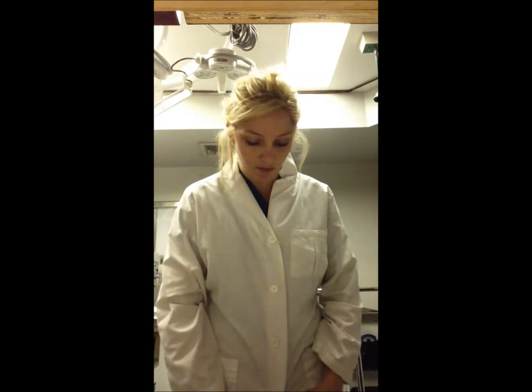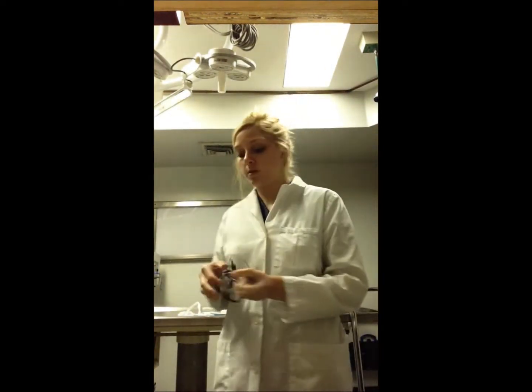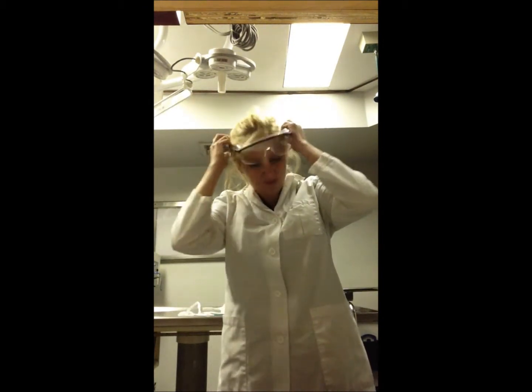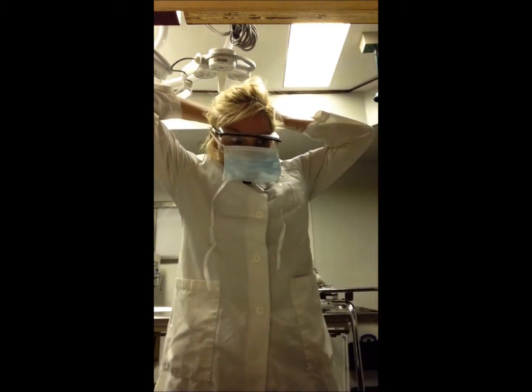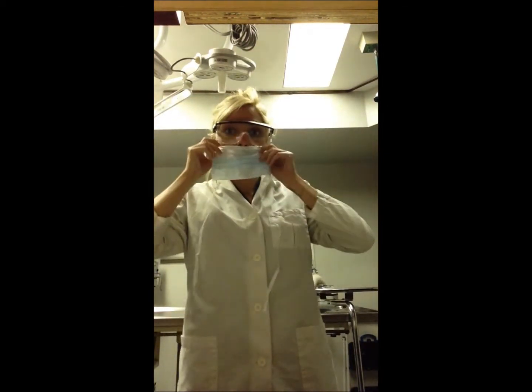Some necropsies, if they're preserved, they would be preserved in formalin. So you want to make sure you don't splash any formalin on yourself. You want to protect your eyes from the fumes. So we have goggles. And then you always want to properly place the mask. So you cover your nose and mouth, just in case there's any splashing as well.